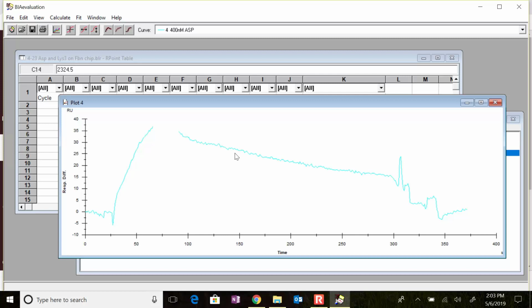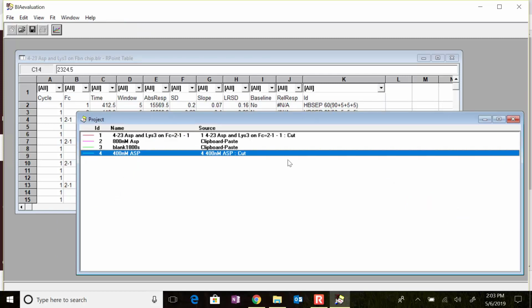Sometimes you can find it. But once I get a few more steps removed from this, if I want to redo this, I'm going to have to go back and start from the beginning. Okay? But I'm pretty happy that that is okay. And if it doesn't fit with the other data after all I've done, then I can just throw it out of the fit later. Okay?